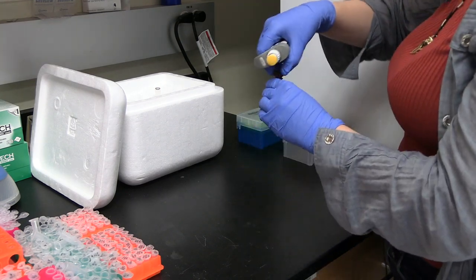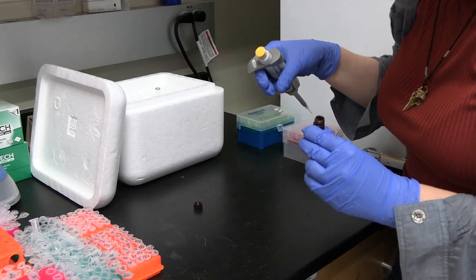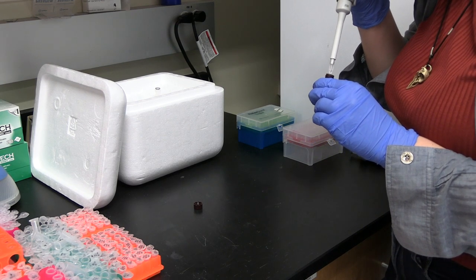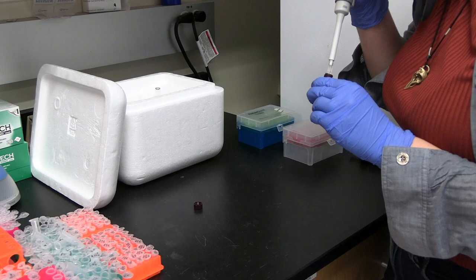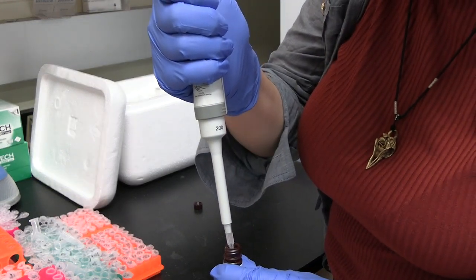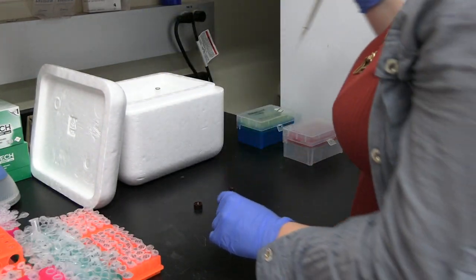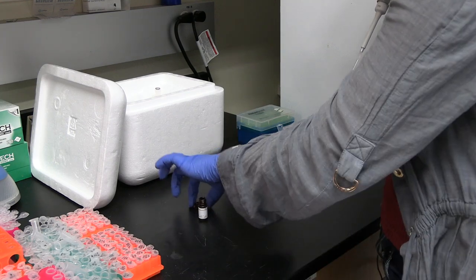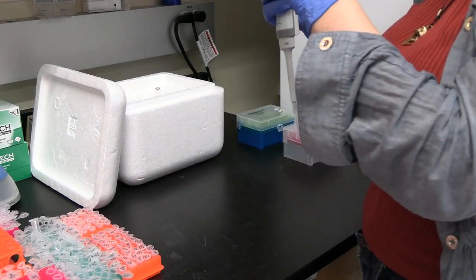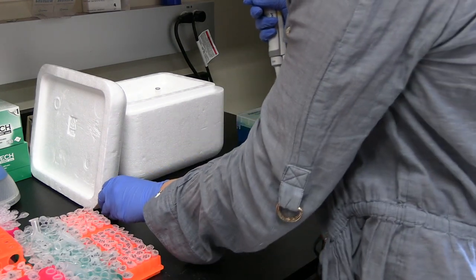tap with the pipetter. Okay, when you're pipetting things that are kept in dark vials, try to get a sense of where the line is, but just do it really slowly. Make sure you're not plunging your whole pipetter in there, but do make sure you're making contact with the liquid. And then slowly pipette up. Okay, looks like the volume filled. Close that. Yeah, you want to be careful around DMSO because it'll absorb into your skin pretty much instantly. So make sure not to spill any.